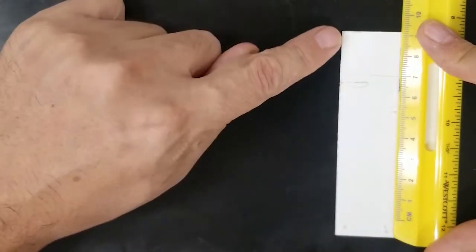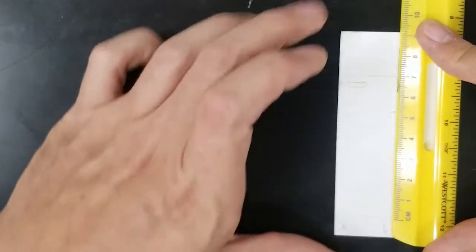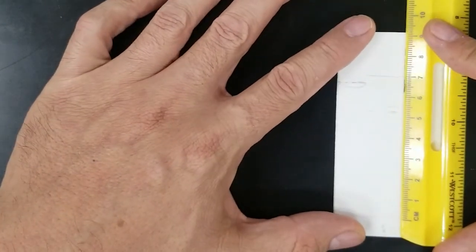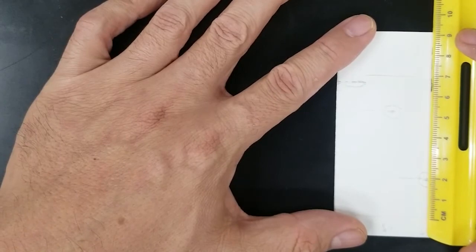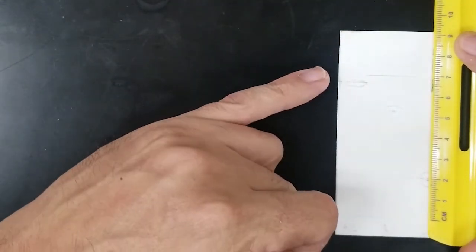I wanted to point out the solvent front line looks to me to be about 6.9. Moving along, we have the last one here. This is for caffeine. I do want to point out that the solvent front is the same for all three samples because they were all on the same plate here. Okay, this looks to me to be about 1.9. It's a little bit over 1.9 for caffeine. So that's the caffeine line there.